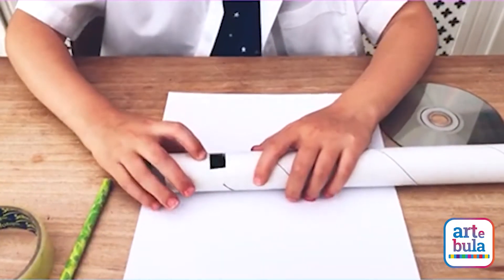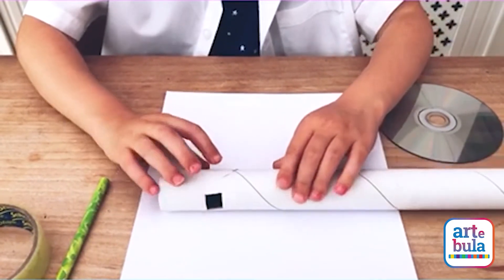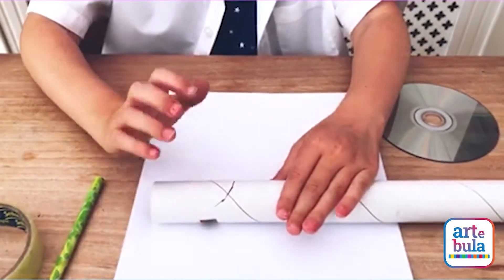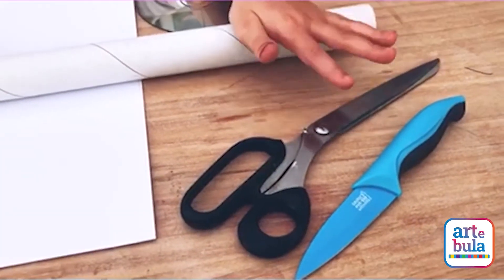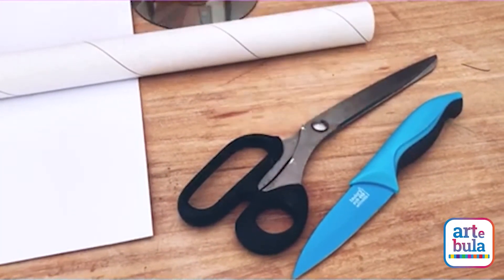Next you're going to cut a hole directly opposite your 45-degree angle split. You might want to get an adult to help you cut it out with your scissors and knife again.